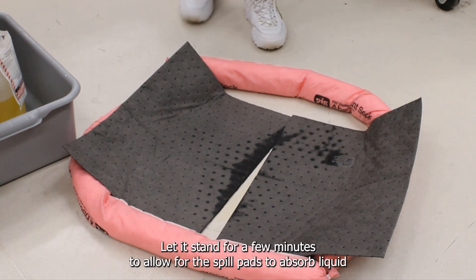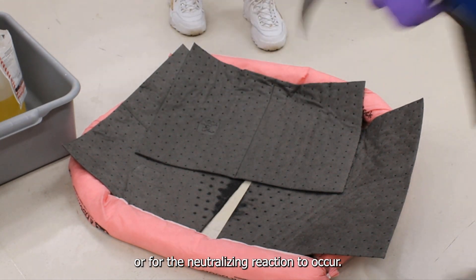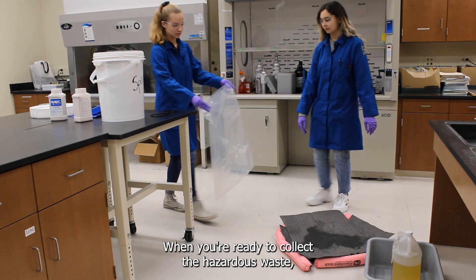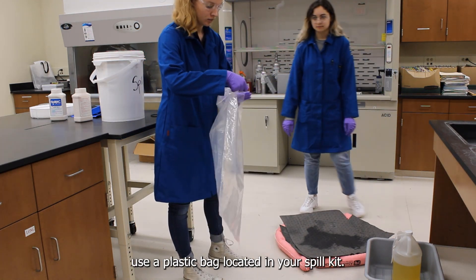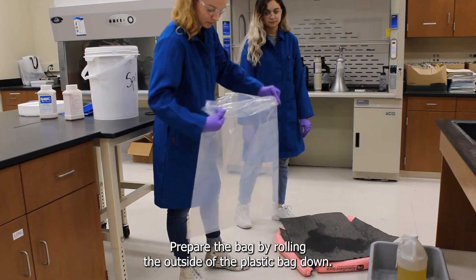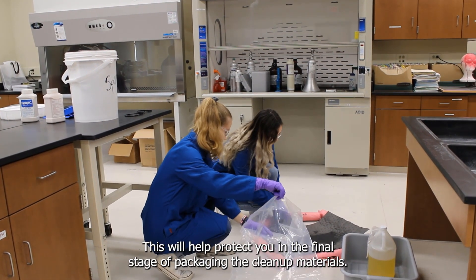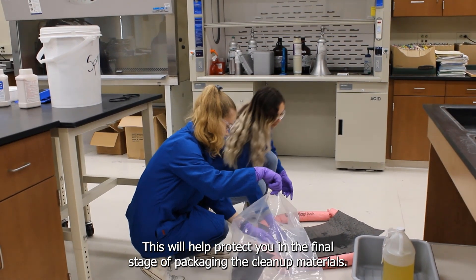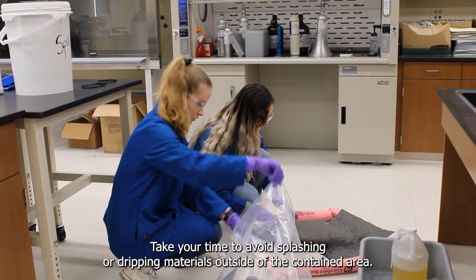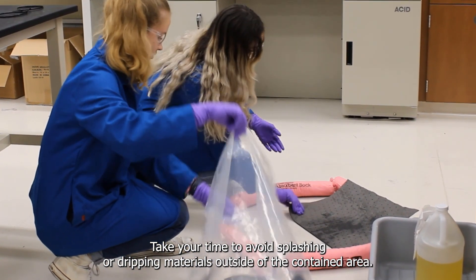Let it stand for a few minutes to allow the spill pads to absorb liquid or for the neutralizing reaction to occur. When you're ready to collect the hazardous waste, use a plastic bag located in your spill kit. Prepare the bag by rolling the outside of the plastic bag down — this will help protect you in the final stage of packaging the cleanup materials. Next, put all the materials you used into the bag, taking your time to avoid splashing or dripping materials outside of the contained area.